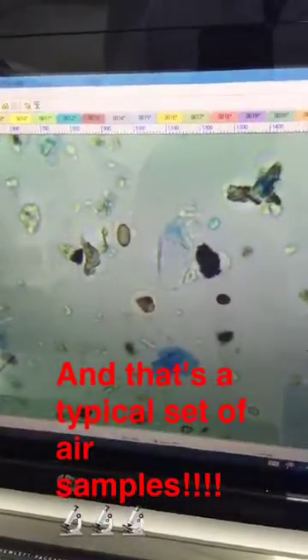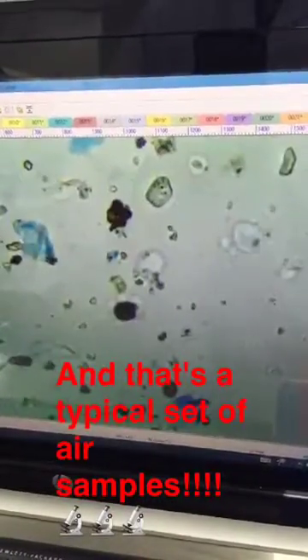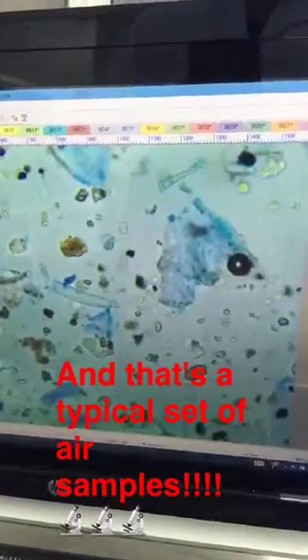A few examples of what I see under the microscope on samples that have been sent in to us for analysis — it's pretty strange under there, isn't it?